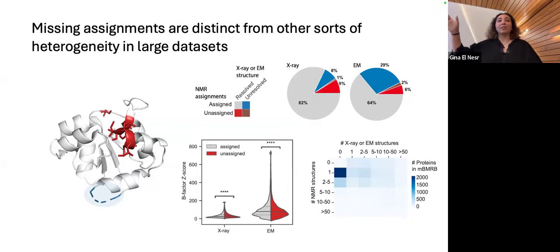Ours is standardized, curated, and public on these missing assignments, and hopefully future data sets along these lines. The tough part about BMRB was actually just standardizing it. If we can get the standardization, or even just the identification and labeling for cryo-EM, for HDX, for all of this, that these are the observables that might be important here, I'm sure there's a lot someone could do with all that information.